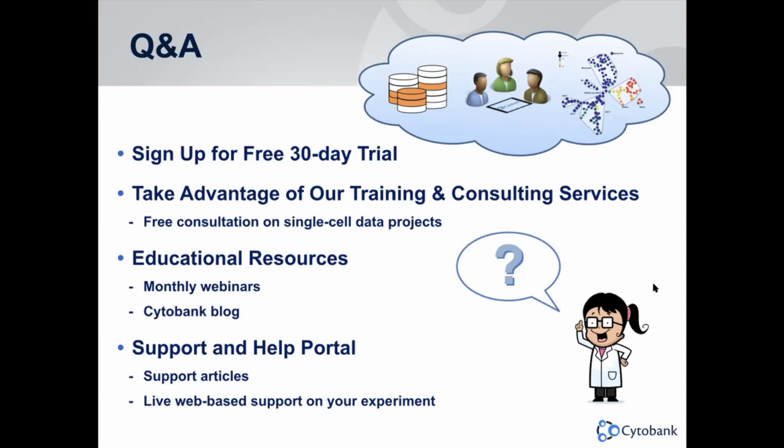Yeah, so actually that's exactly with the Citrus run. For the Cytobank setup, you can go very low. You can put in the equal sampling. We can go very low. However, as Anna said, it needs to make biological sense. If you only input 100 events per sample, then the significant finding probably doesn't make any biological sense.